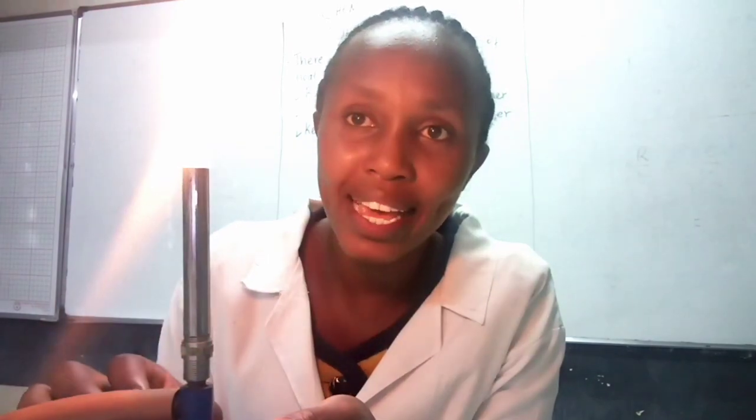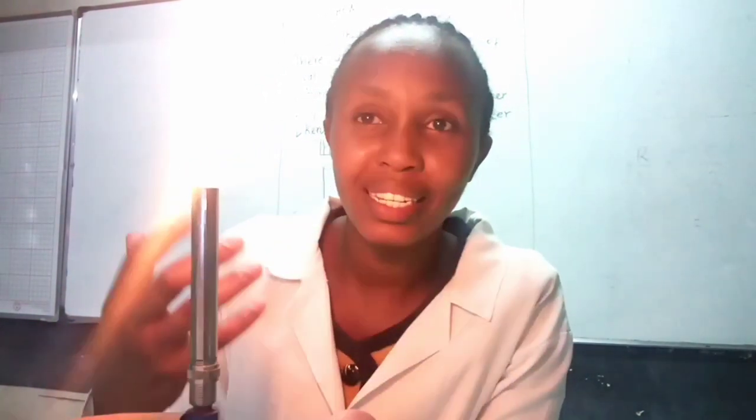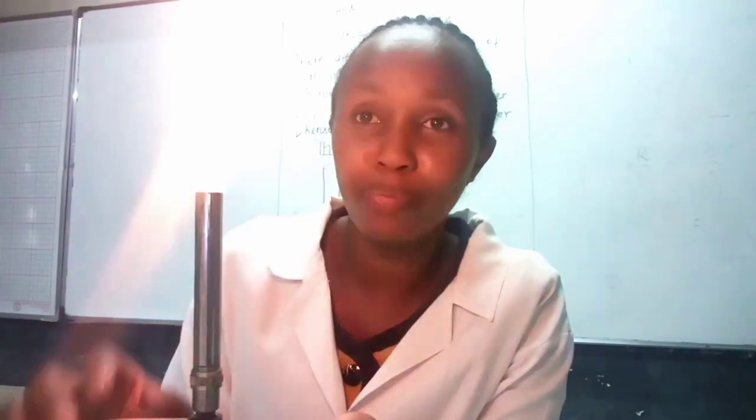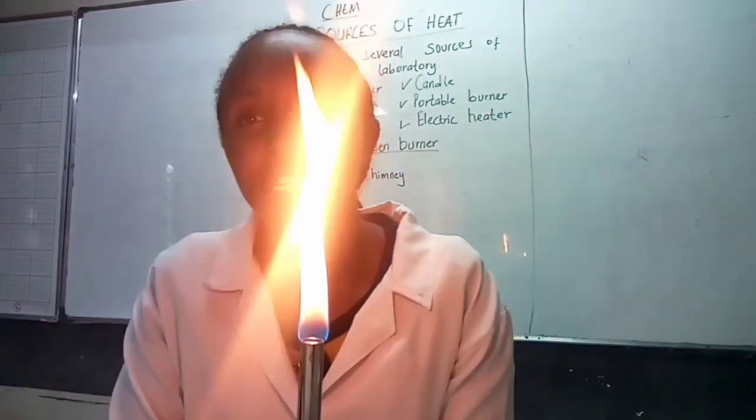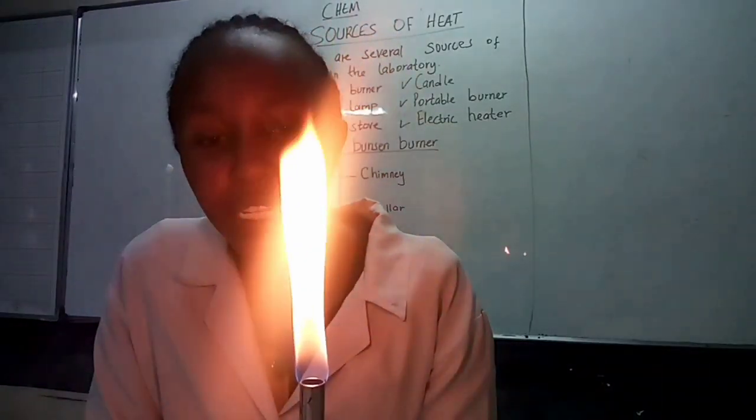There are two flames. The first is the luminous flame, which is bright yellow in color. Let me put it on. The first flame is produced when you completely close the air hole — you can see the flame is already giving some light. This flame is called the luminous flame.